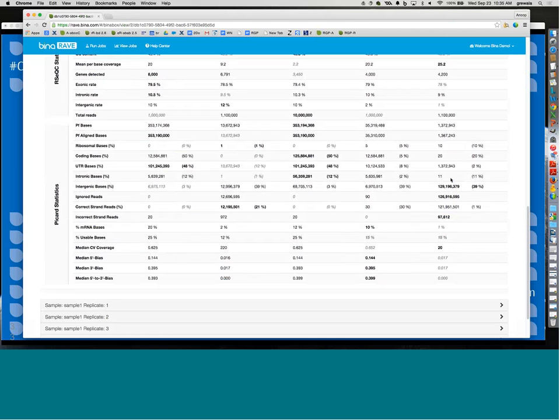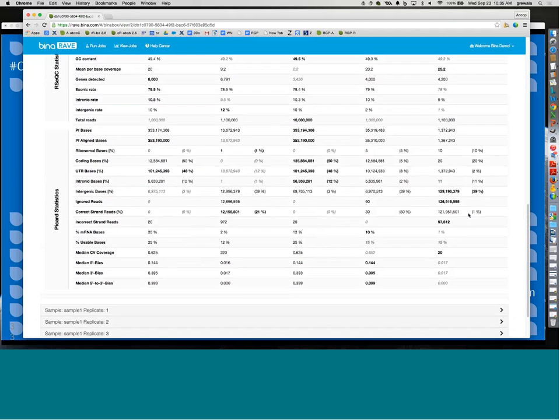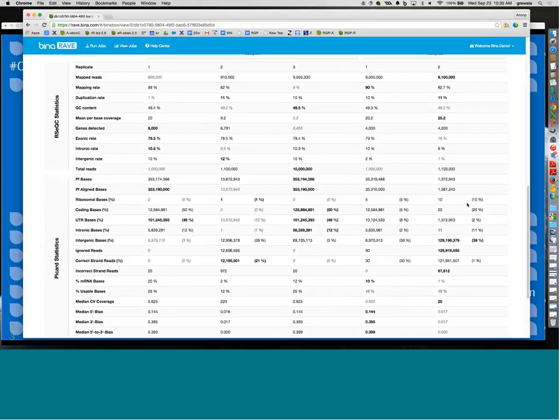So there's another question. How are data sets uploaded for RNA-Seq analysis? Well, it depends on your deployment for Bina Rave. If your deployment is an on-premise deployment, then the data sets will be read from shared storage.